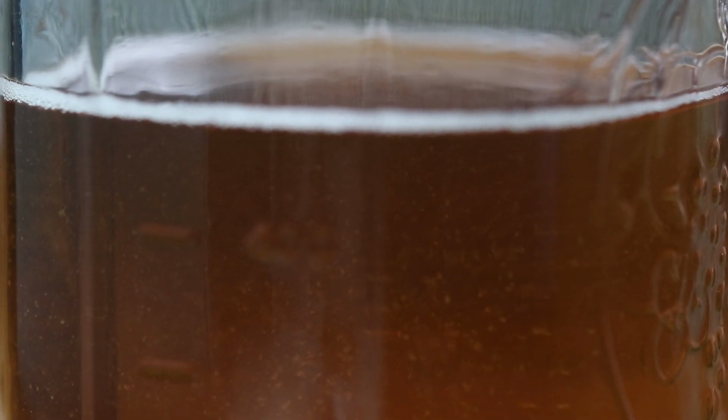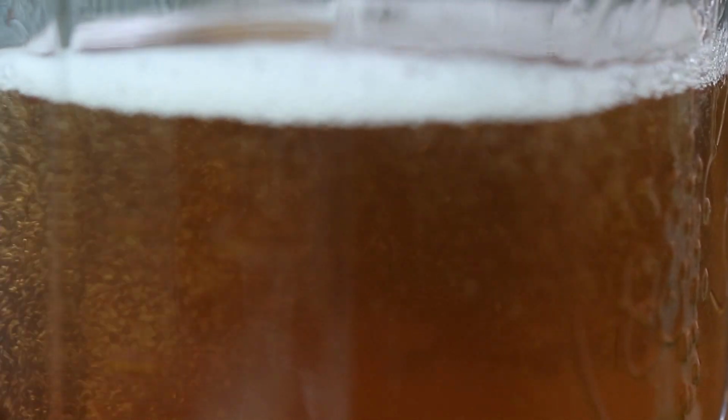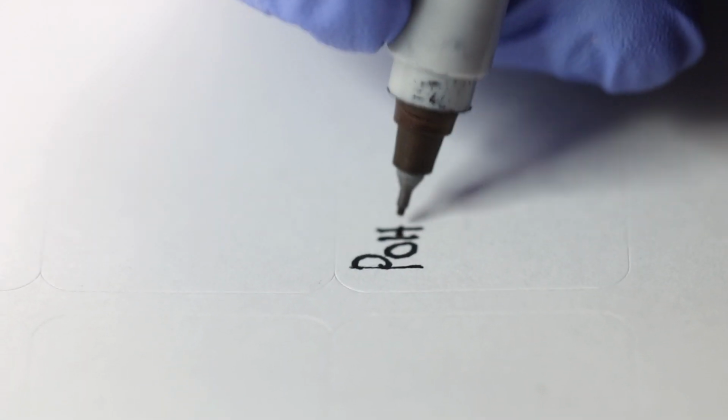Colored biopsies are easier to see. The clear ones are obviously much more difficult to see. Then you just place it in your jar, depress it, return the liquid culture, and now it's time to label. Labeling is important for tracking. We do a strain name. This is the Pohu strain from Field and Forest.